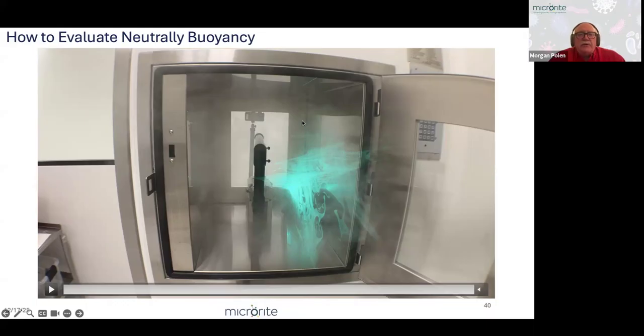Stephen, how many observers would you recommend? Finding a balance of enough to corroborate findings, but not too many to influence results within the clean room. Well, the observers don't necessarily have to be in the clean room. The observers can be looking through a window, or in the case with some of the systems available, like, for example, what we use, they can be sitting outside or even in a conference room, and the smoke study can often be live streamed. But you at least need a customer representative on site with you, obviously the operators.